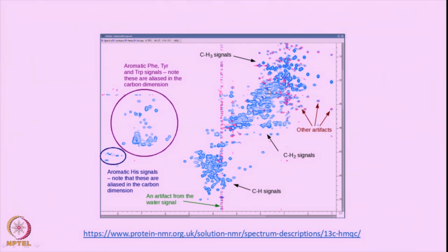And here you have the gamma protons and the beta protons of the side chains in the amino acids of the proteins. Those appear here in the proton chemical shift, and the carbon chemical shift occurs here. This is up to 20 ppm, this is between 20 to 40 ppm, where you have the beta and the gamma chemical shifts. And of course you also have the delta chemical shifts, the gammas and the deltas in the side chains of the amino acids, which come here, and the glycine alphas also appear at this point, which is around 40 to 45 ppm.